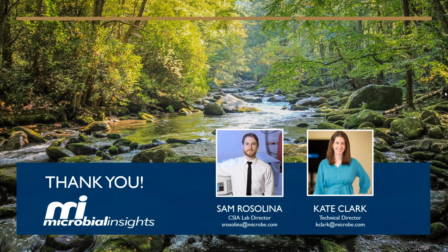Yeah, absolutely. That is a great question. Yes, anytime degradation is occurring, then we see a delta value increase over time or down gradient. And so this is important because it allows us to look beyond just biodegradation at a site. We want to know if something is degrading or if it's not degrading.